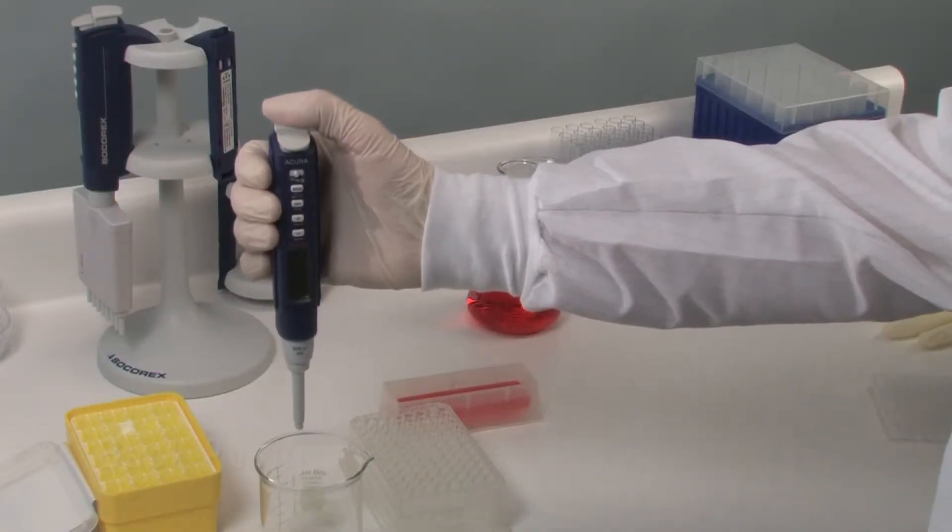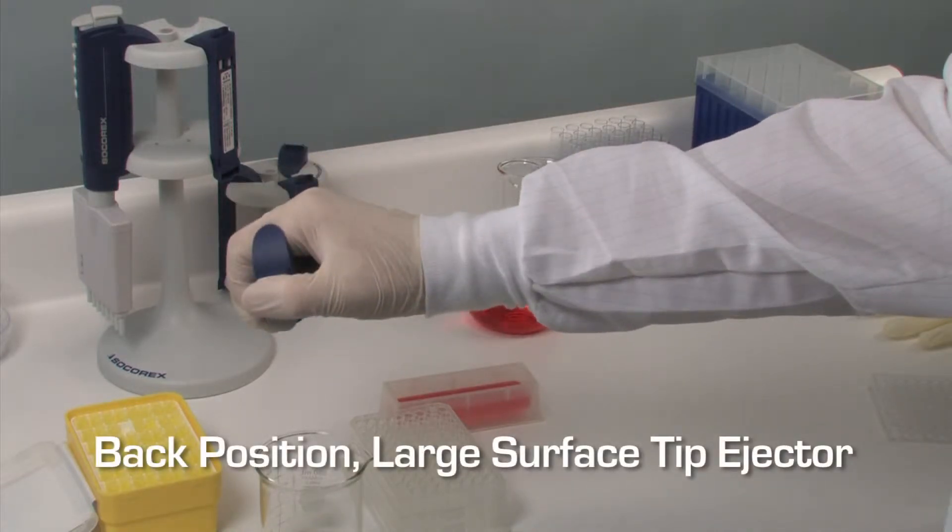Tip ejection is easier than ever. Maximal efficiency is obtained with a large surface ejector button, ergonomically located in the back.